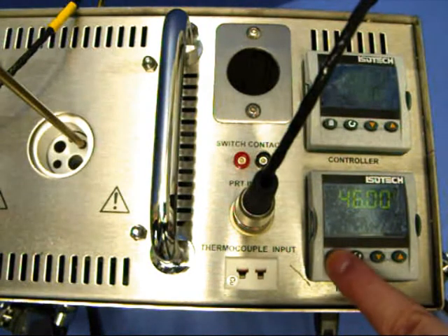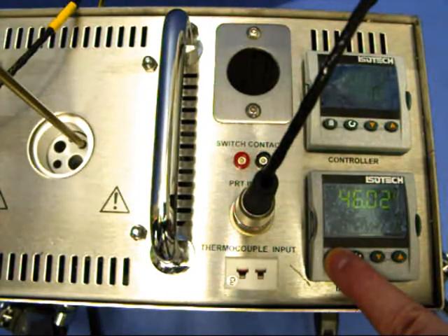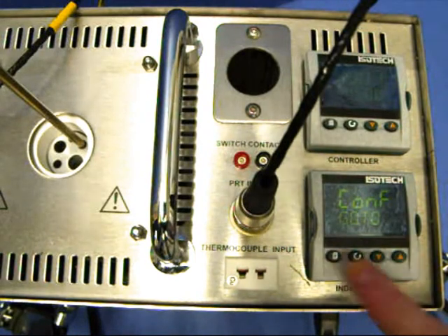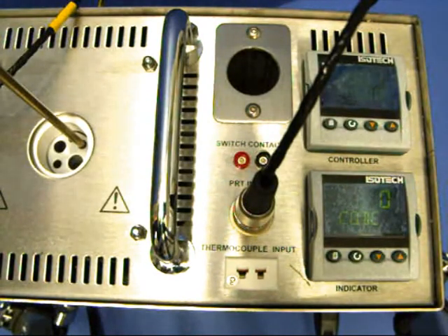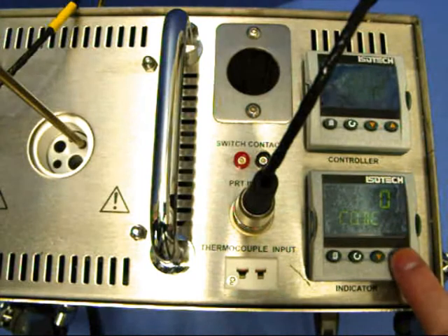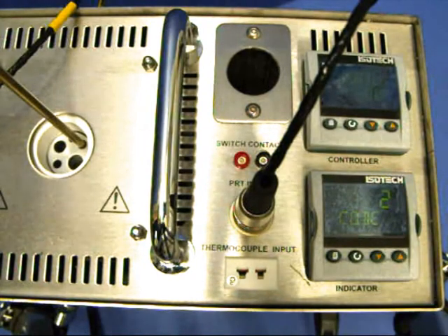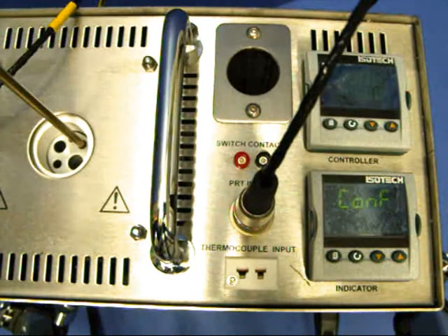Hold the page key down until the upper display indicates CONF GO TO. Then zero code. Set the code to 2 using the up key. The display will then read CONF.